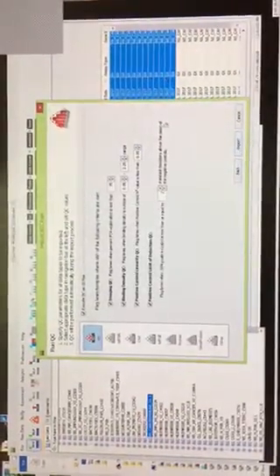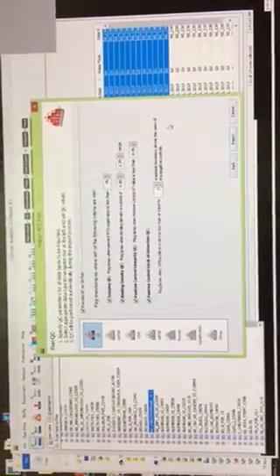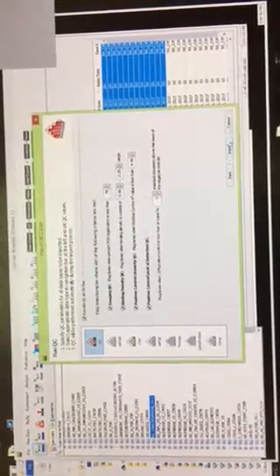This can be flagged if your positive controls are low, or sometimes I've seen this flag when there's a lot of background and your negative controls are particularly high. That's just a brief rundown, and all this information's in the NSolver manual if you need to refer back to it. So I'm going to import this here.